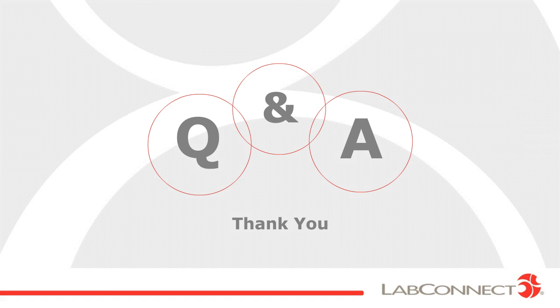Thank you, Liz and Joe, for that webinar and all that information. Very valuable. Now we have time for some questions. Our first question is, what type of parameters do you evaluate for analyst qualification?